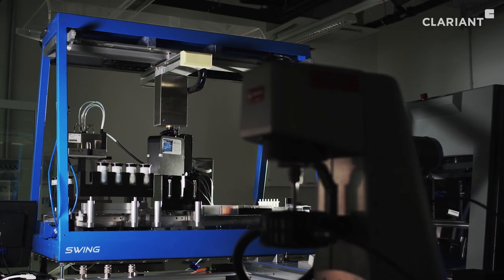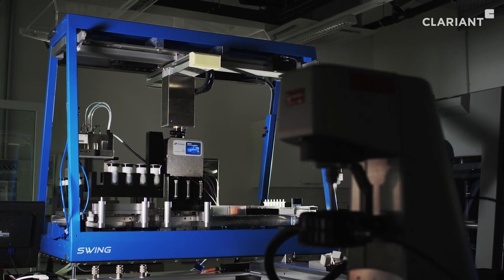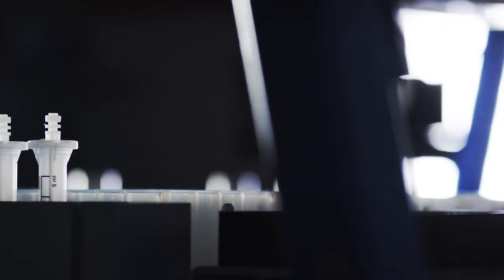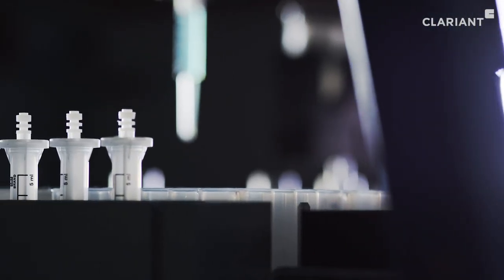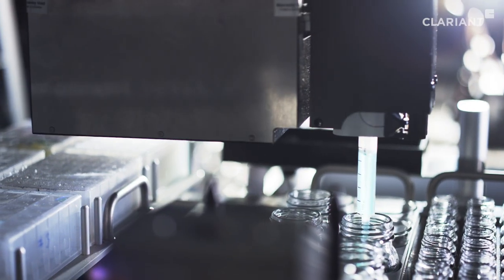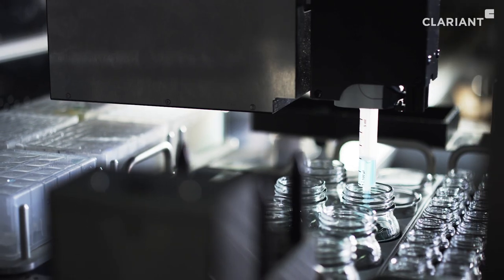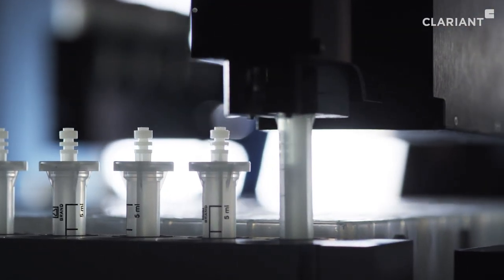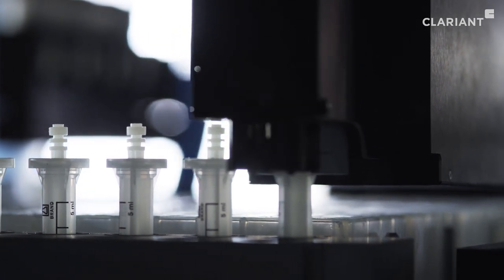The proper formulation is crucial in optimizing the performance of key actives and is usually work-intensive to discover. This requires the weighing, dispensing, and combining of several ingredients in different forms and at different ratios. Our automated dispensing system makes light of this task by executing multiple complex mixtures of solids, liquids, paste, and gels.